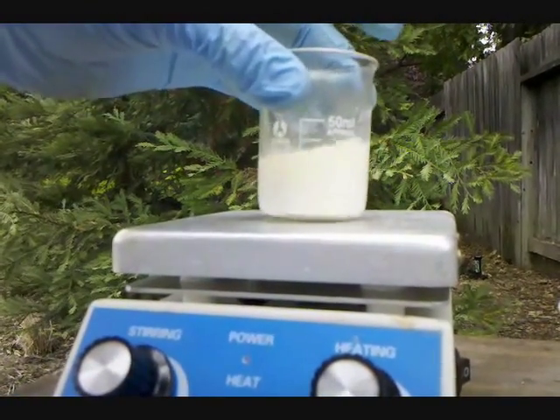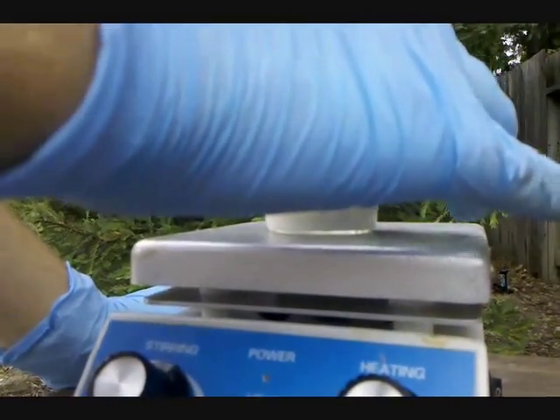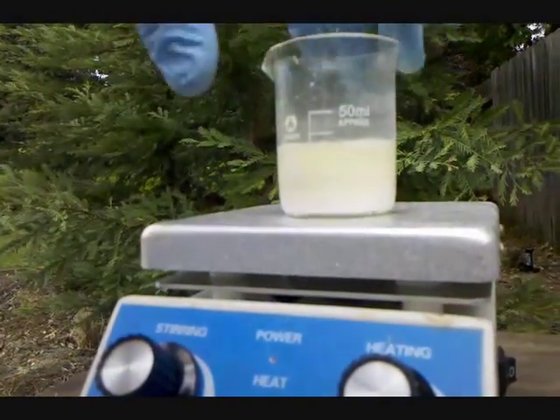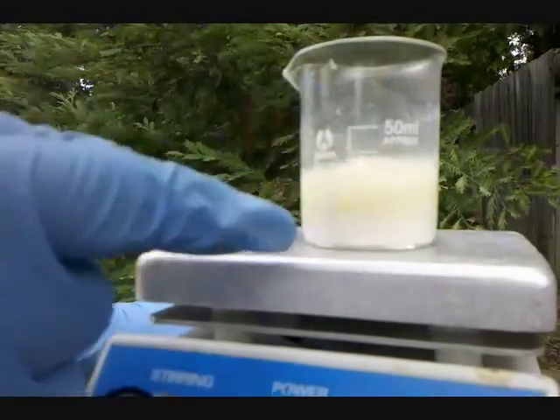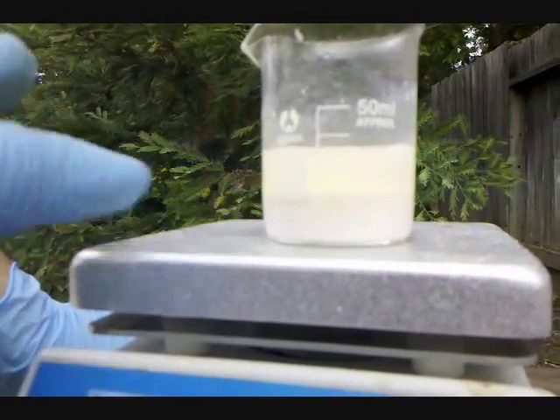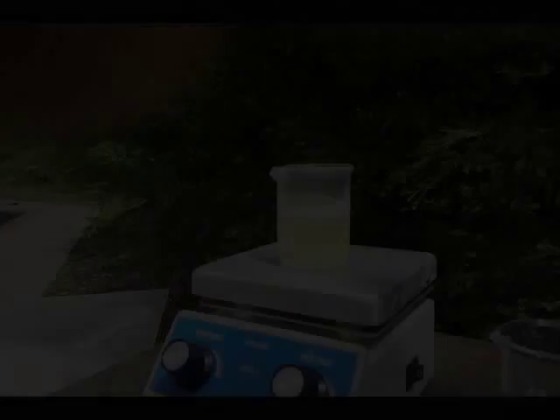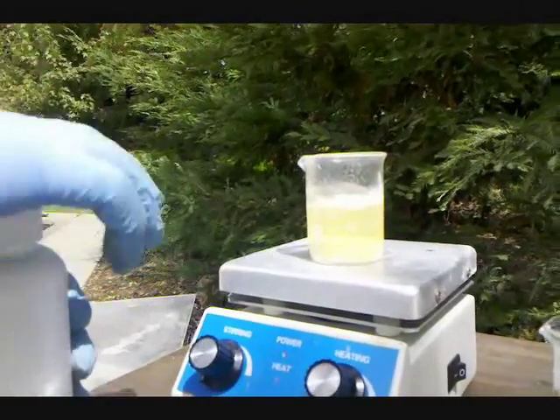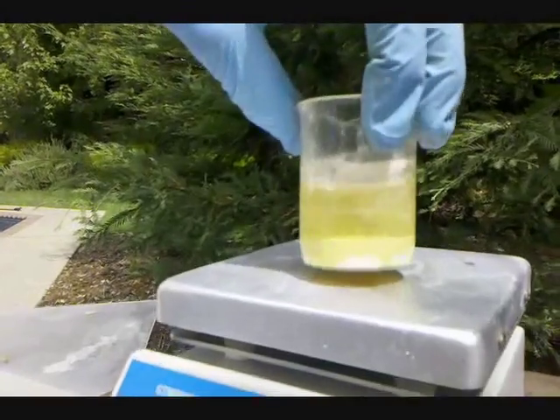Bismuth Oxide is a yellow color. So heating is added, and hopefully with heating, we'll see a yellow precipitate of Bismuth Oxide. And immediately you can start to see it — on top there's a yellow layer and a white layer. Upon the addition of some Anhydrous Sodium Hydroxide, you can see the yellow precipitate of Bismuth Oxide formed.